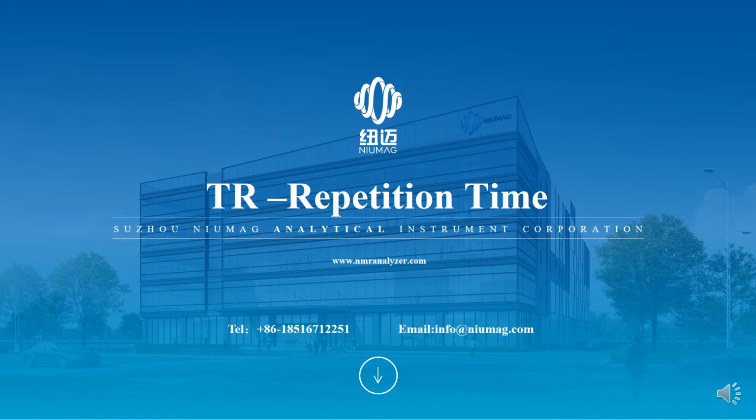Hello everyone. In this class, we will talk about the NMR TR, repetition time. TR is actually a very important parameter for both NMR imaging and the relaxation analysis. And the TR setting is very important.